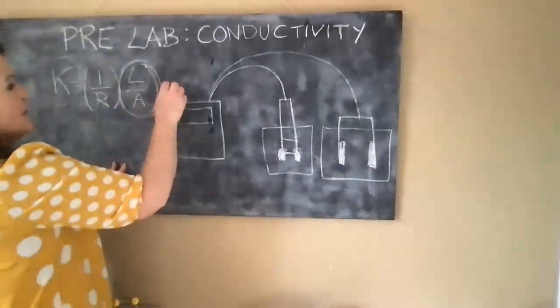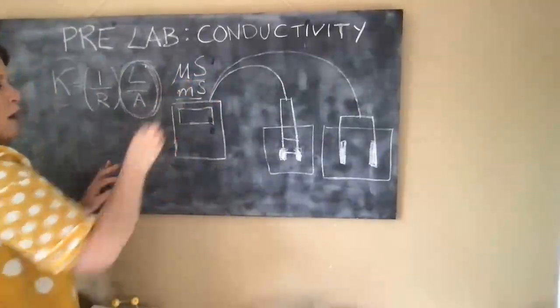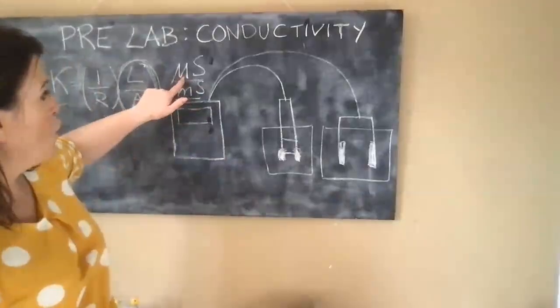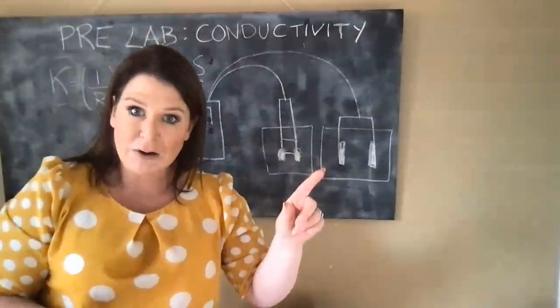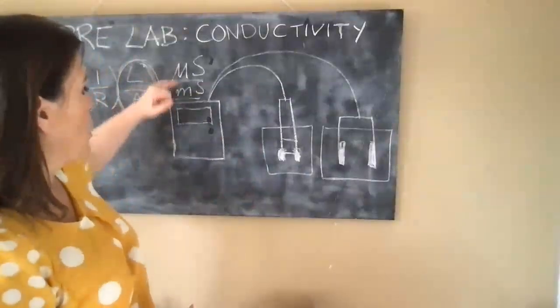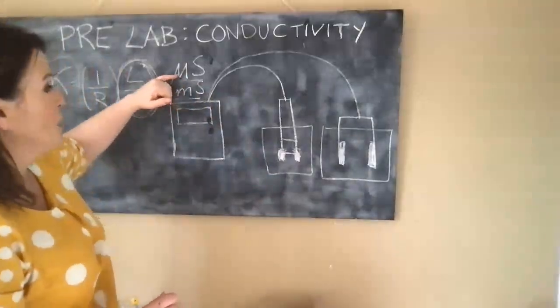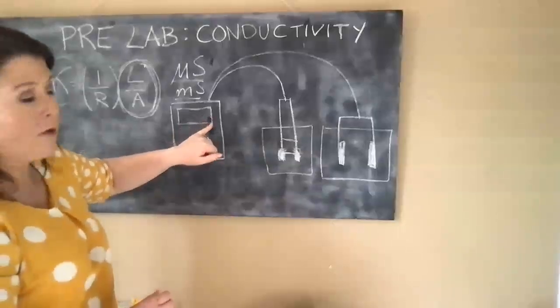Make sure when you note the conductance values that you note which unit you're dealing with, because later, particularly in the second part with the titration, you'll have to make sure they're all in micro or all in milli. You get the choice which way you want to go. There'll be no difference, but they must all be in the same unit. So keep an eye out every time, and it will say it clearly on the meter.